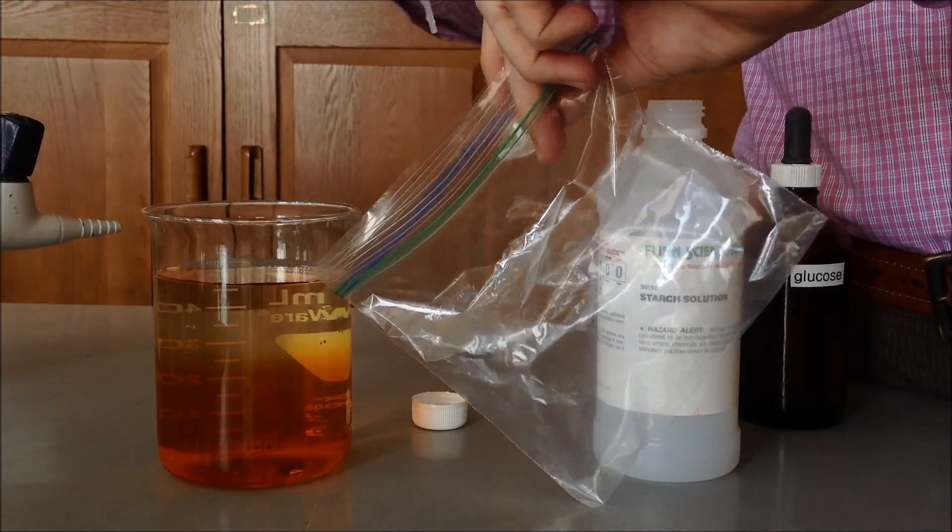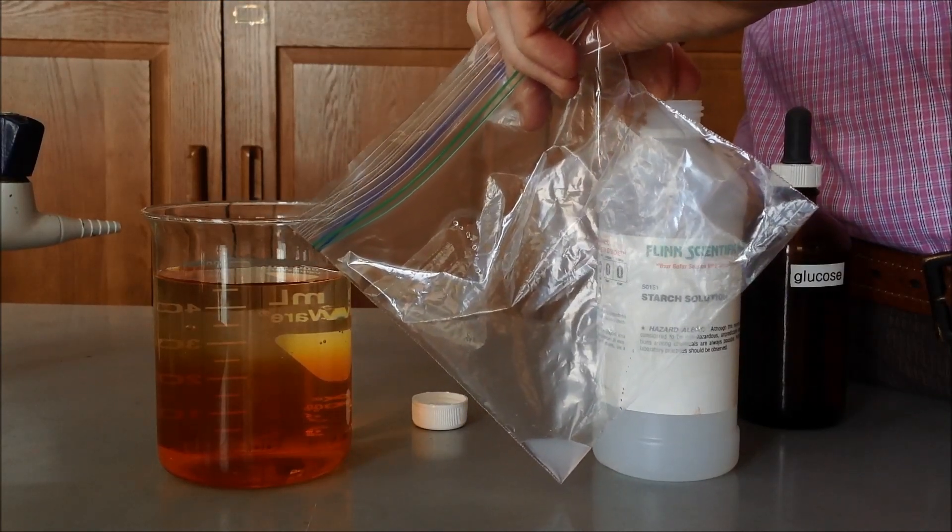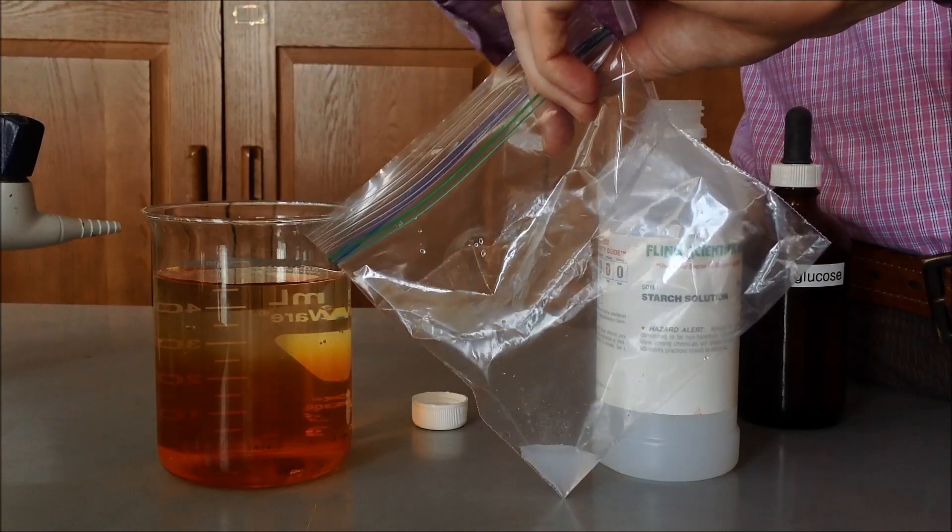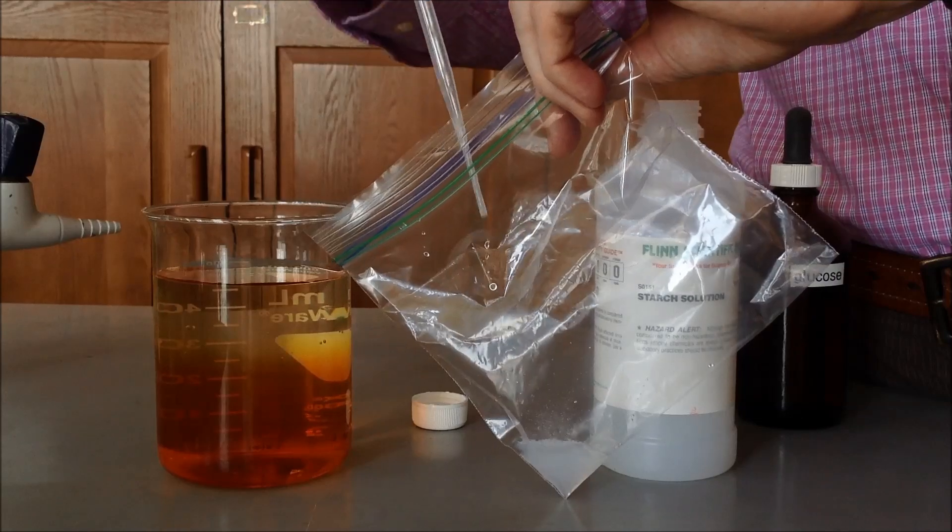Remember, the bag is serving as a membrane. It's not perfect, it's not exactly the same as a cell membrane, but it still has, essentially, small openings in the bag that can allow for certain things to pass through based on their size.